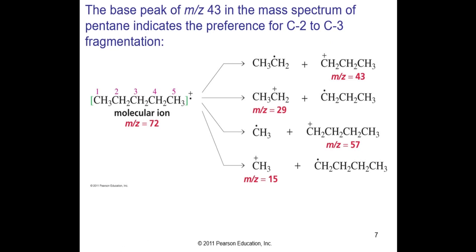Now look very carefully at this diagram and don't proceed until it makes sense. Over on the left, you see in brackets a radical cation. You knocked an electron out with the filament. You're detecting this radical cation. There's an unpaired electron somewhere in the whole bunch of sigma bonds. You knocked a sigma electron out. So you have a positively charged material which also has an unpaired electron.